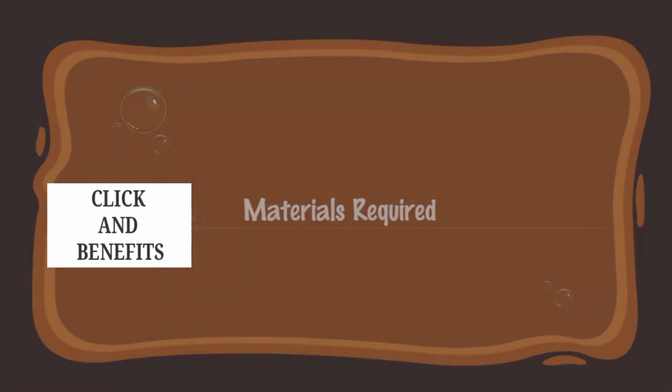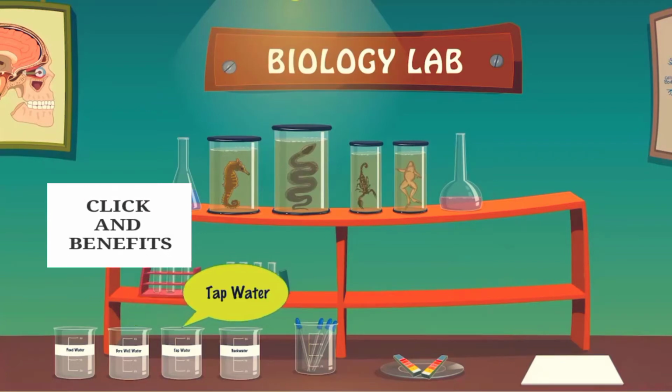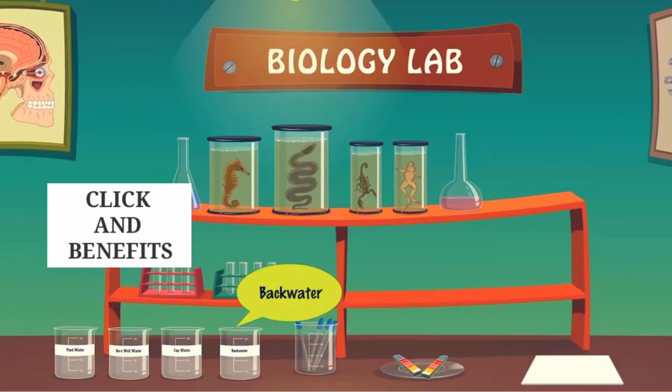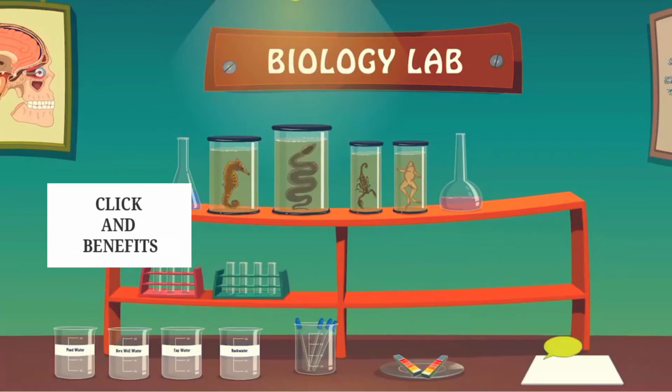Materials required: water samples from a pond, borewell, tap water and backwater, droppers, pH paper strips and a tile.